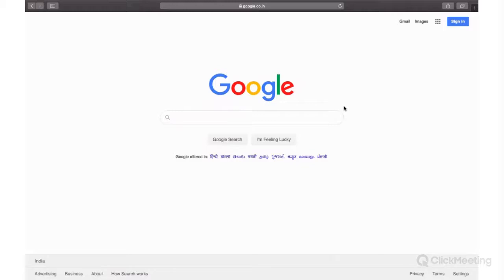Today we are going to have a look at how the NCBI virus website can be used to help you with your SARS-CoV-2 research. My name is Dr. Anusha and I am a scientist here at BenCos. So let's get started.